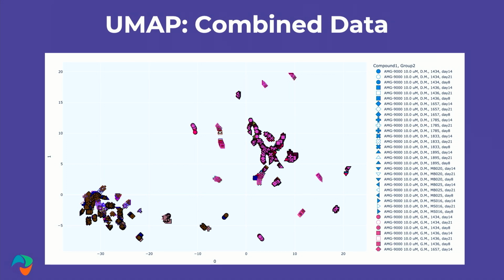And this here is what we call a UMAP. You don't have to worry about what a UMAP is. This just means that you have 2.6 million parameters. We reduced it to 2 dimensions. 2.6 million data points reduced to 2 dimensions. And at the bottom left corner, these are the differentiated cell lines after they've become adipocytes. And at the top right, those are the cells before differentiation.